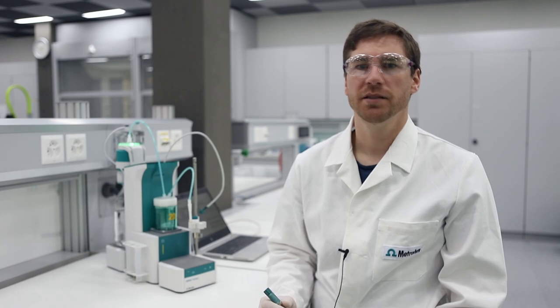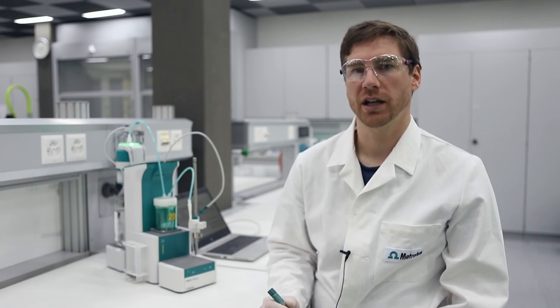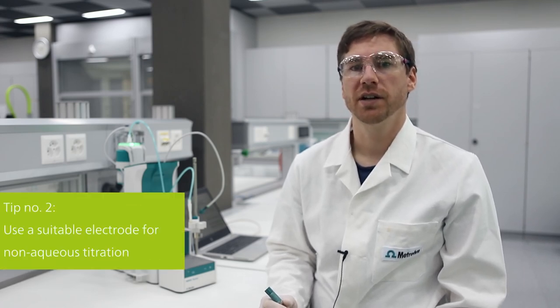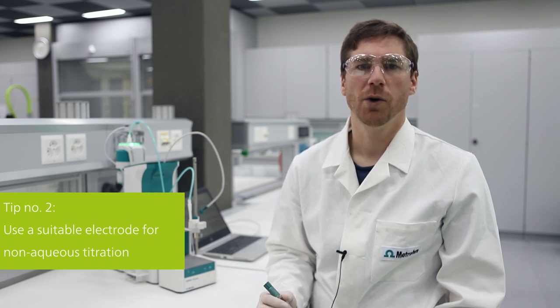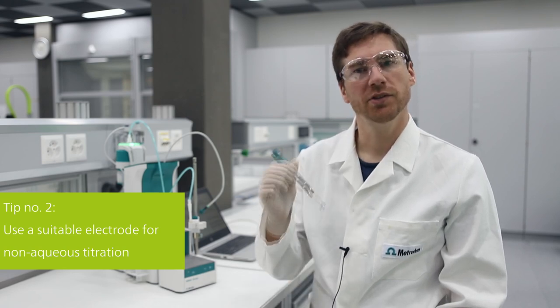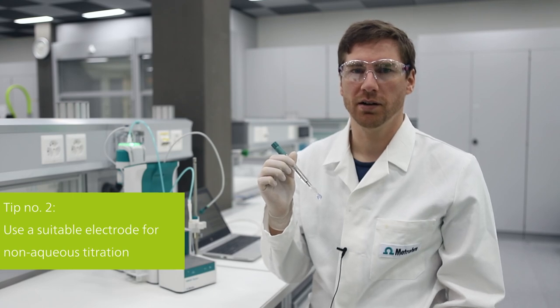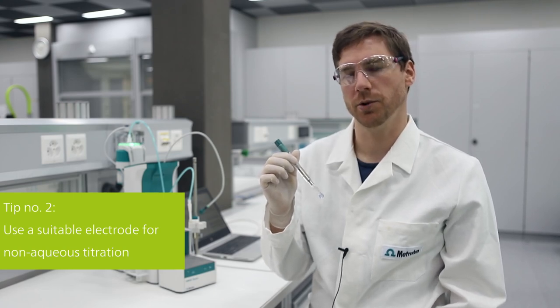Acid number determination is a non-aqueous titration. This makes it prone to electrostatic influences. So here is my tip number two: to avoid electrostatic effects, use an electrode with additional electrostatic shielding, for example the Metrohm Solvotrode.